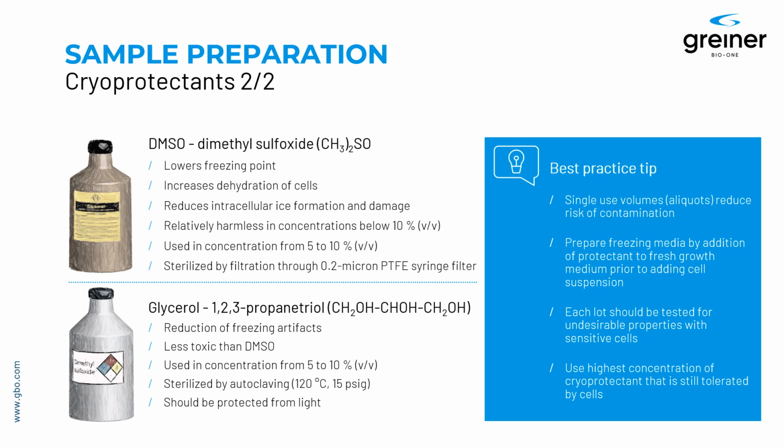Further, each lot of cryoprotectant preparation should be tested for unwanted properties with a sensitive cell line. And last but not least, go for the maximum: determine the highest amount and concentration of cryoprotectant still tolerated by your cells, and then use this in your preparation of cryoprotectant solutions.